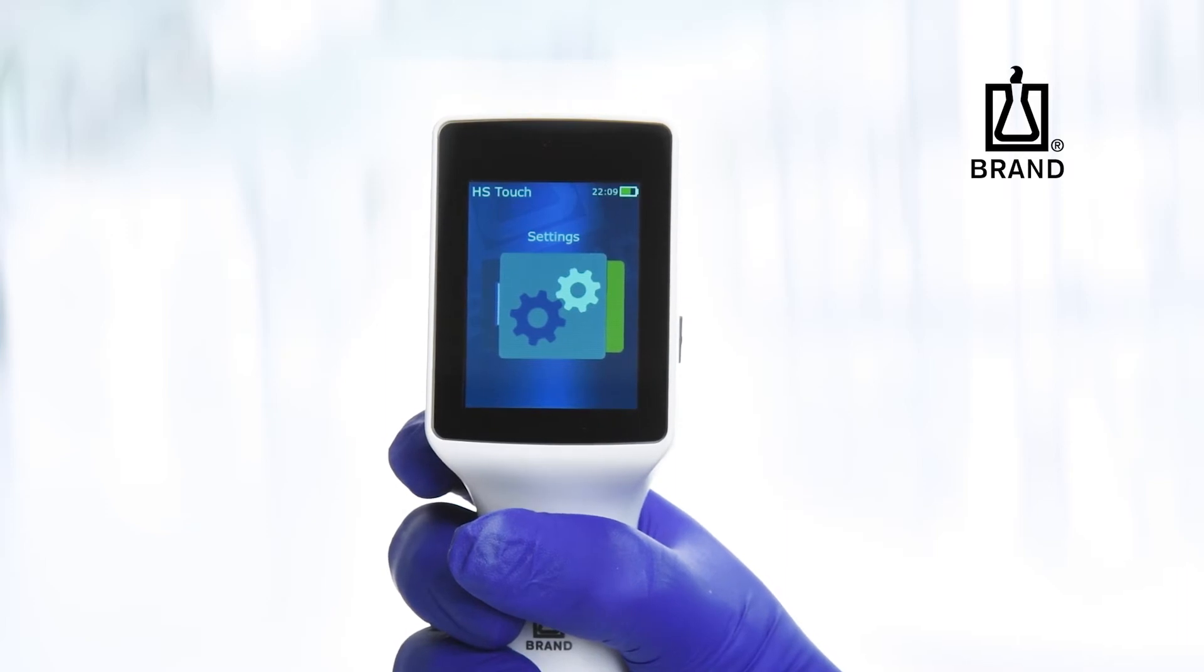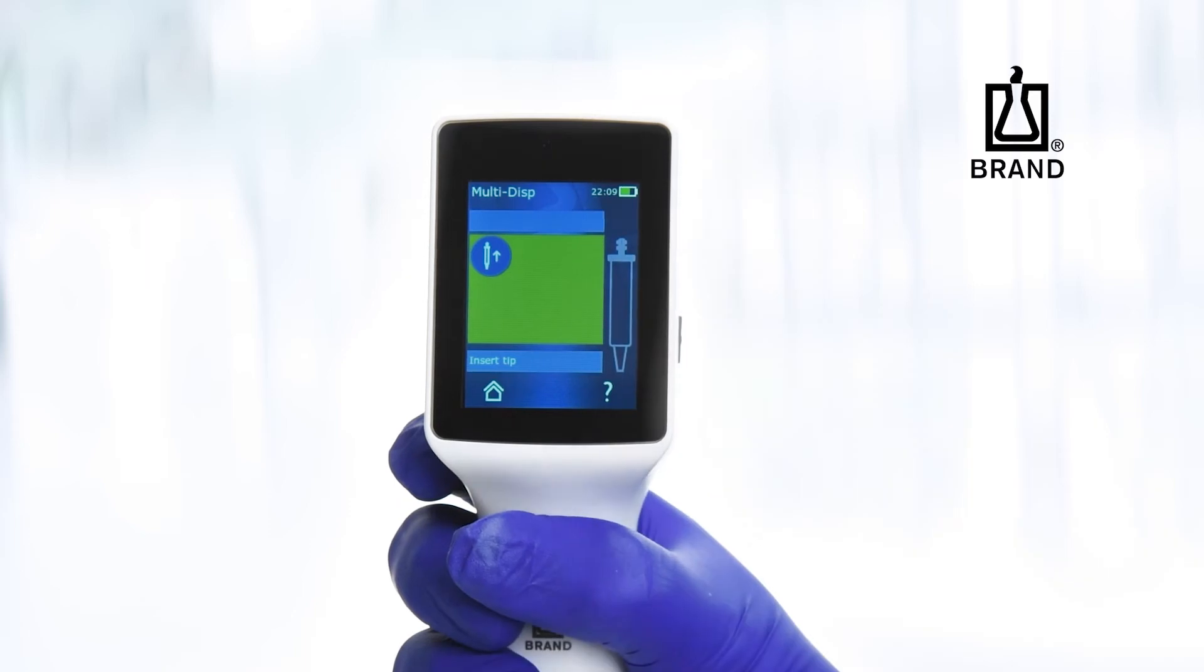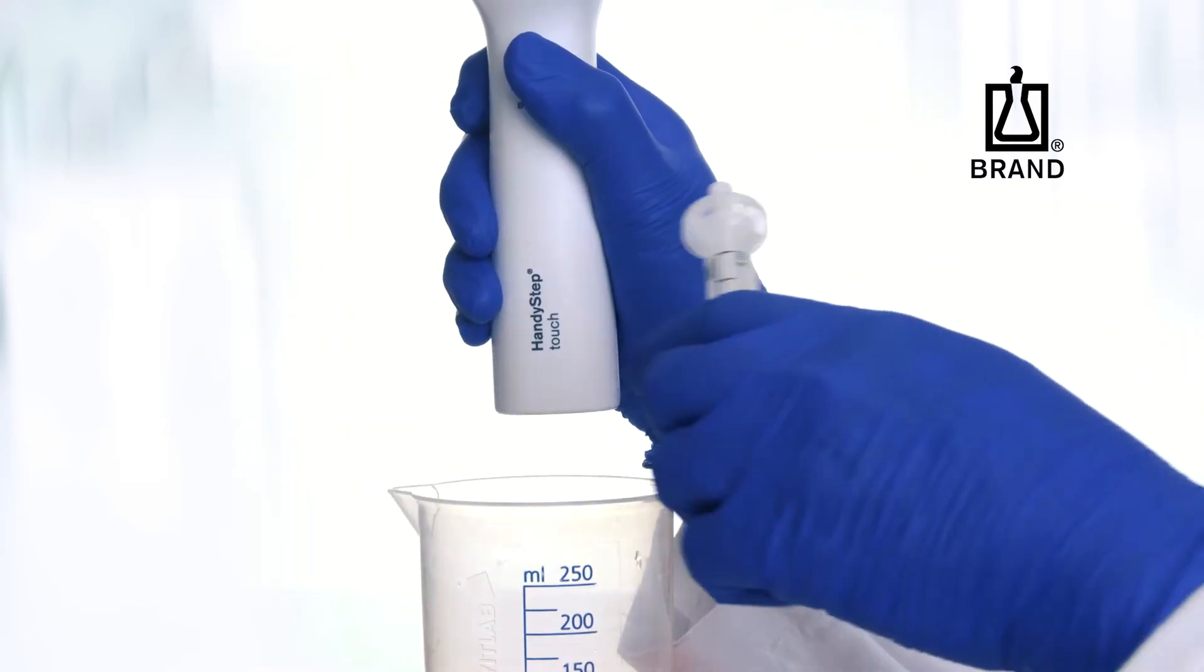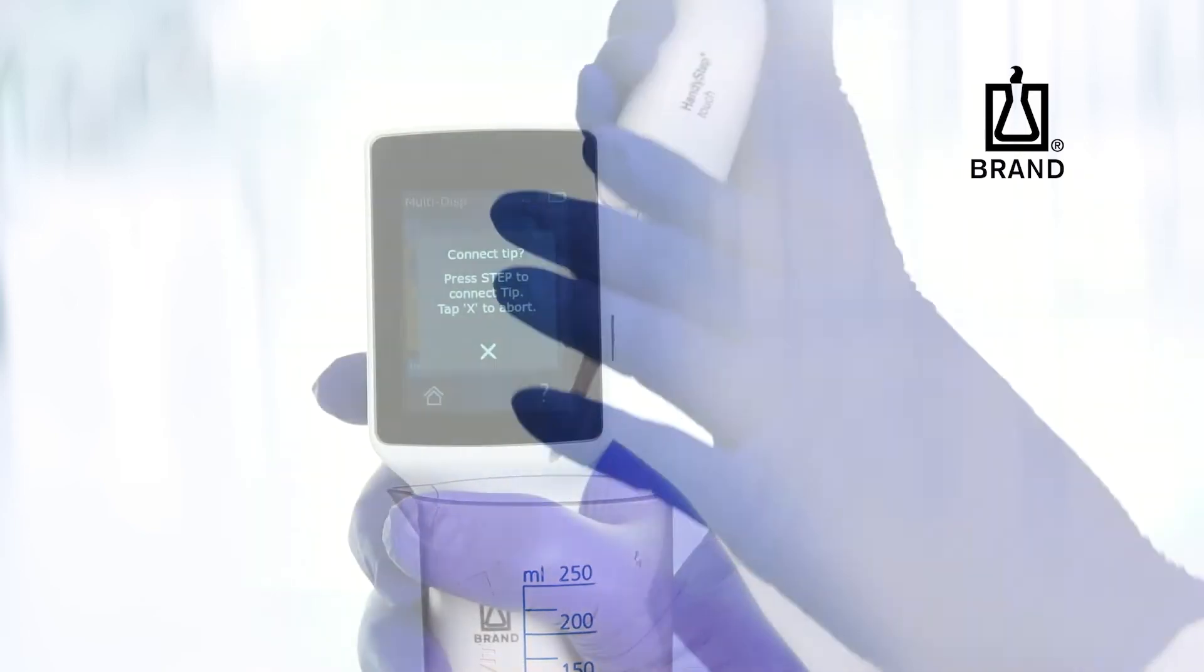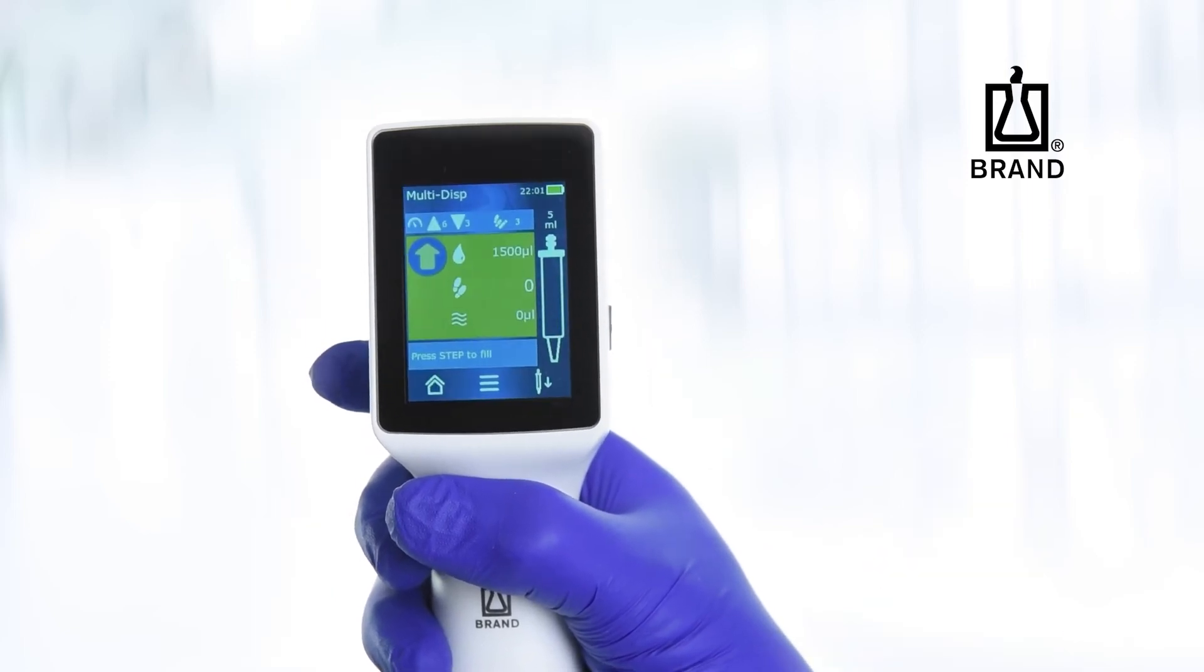Swipe left or right until the multi-dispensing mode is displayed and tap to confirm. Insert a PD-TIP 2 and press the step key to confirm. The PD-TIP volume is automatically recognized.